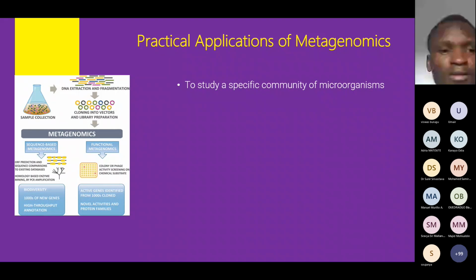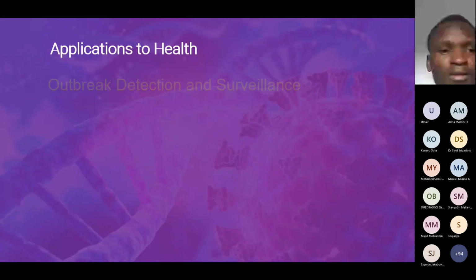Now by the time you begin to evaluate your analysis, you would discover that particular strain in the metagenomic sample. I hope that is clear? As such, you can use this for outbreak detection and surveillance. And you can do this in order to track the spread of infection, or for instance antimicrobial resistance.